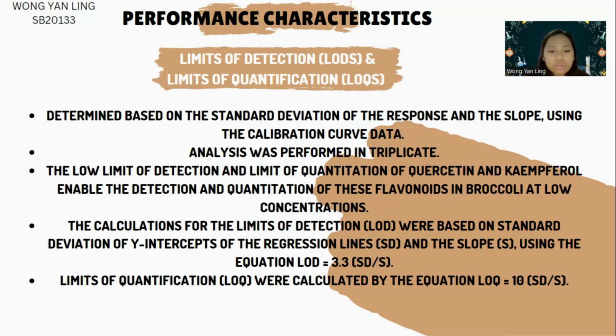The calculation for the limit of detection was based on the standard deviation of the y-intercept of the regression line and the slope, using the equation LOD equals 3.3 SD per S. The limit of quantification was calculated by the equation LOQ equals 10 SD per S.